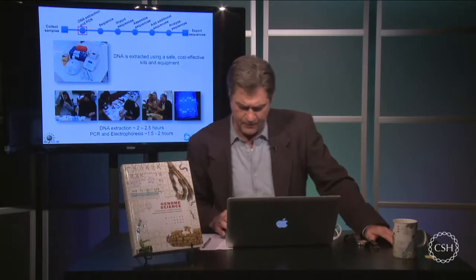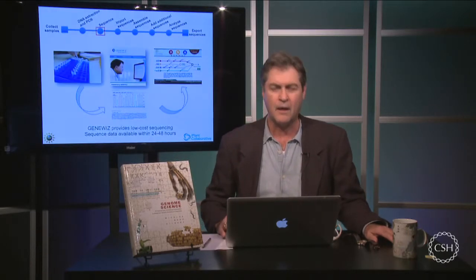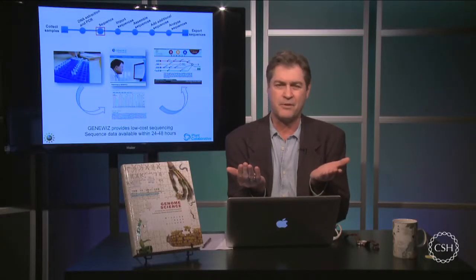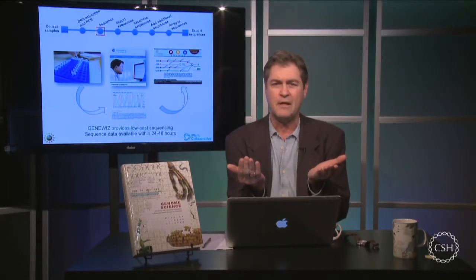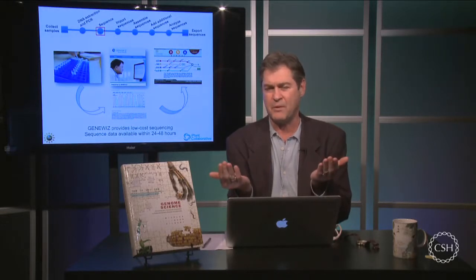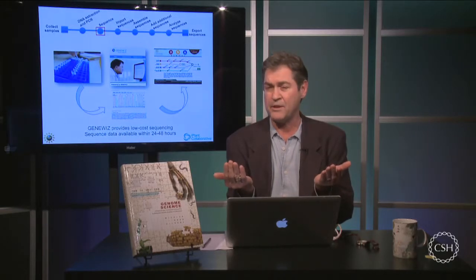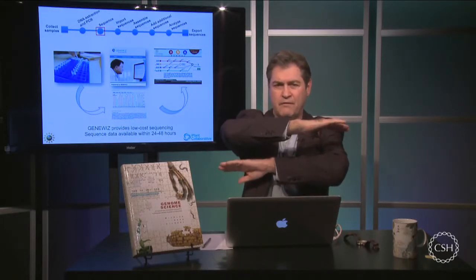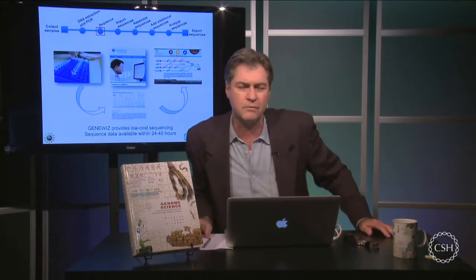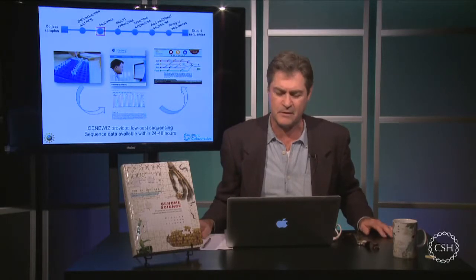Once you know that you've successfully amplified a barcode, you divide the remainder of your sample into two fractions, and you send these out for DNA sequencing. As we'll see in a moment, if you'd like to get data that can be published, you will do a forward and a reverse sequence. If you'd just like to do a classroom activity, a single forward sequence is enough.